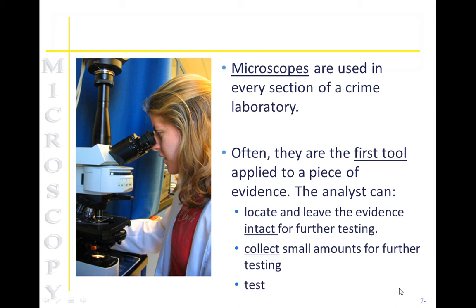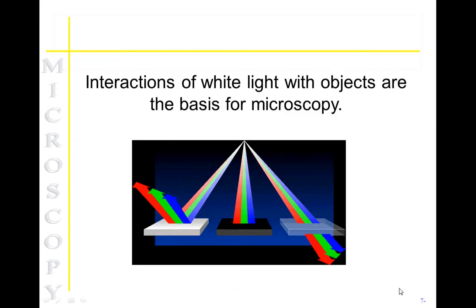The analyst can use these microscopes to help locate different evidence. They might also use it to collect evidence from different items, or they may use it as a portion of their testing.